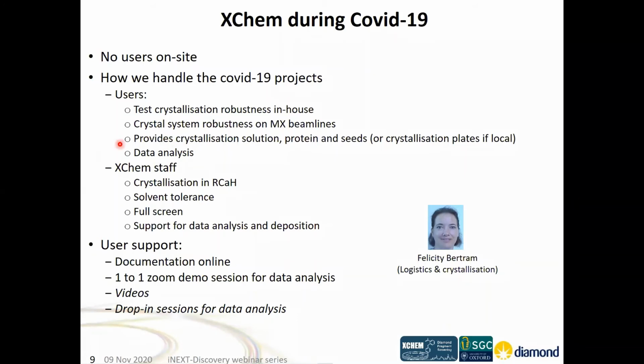You would also have to do the data analysis on your own. Well, not on your own, but supported. What we will do then is the crystallization in the research complex. We will do the hands-on experiment here, and we would support you for the data analysis and the deposition. And there was quite a lot of work.